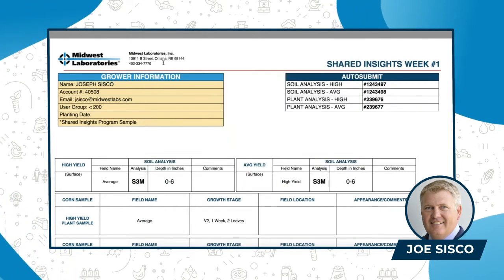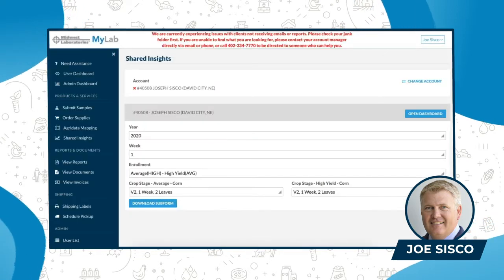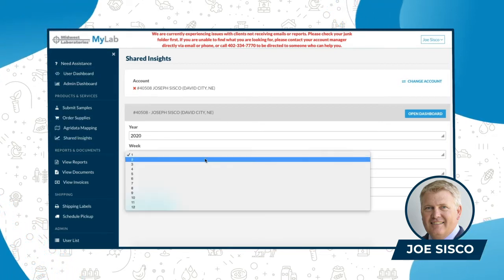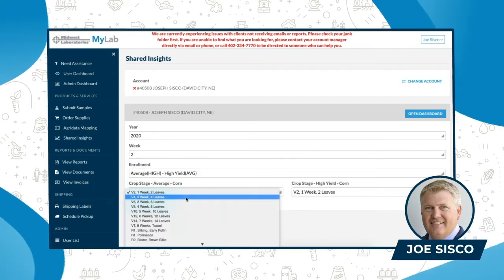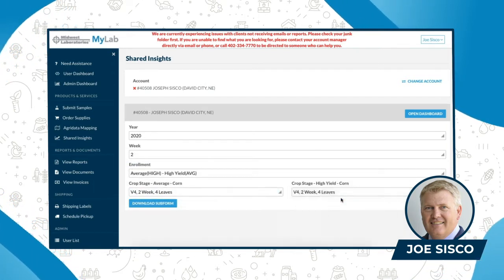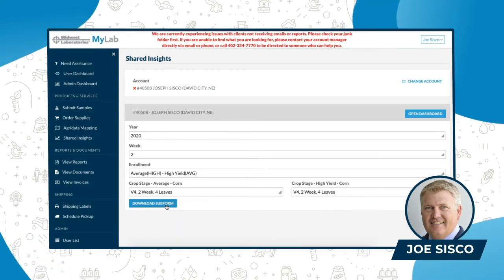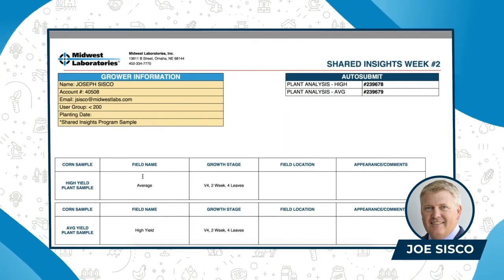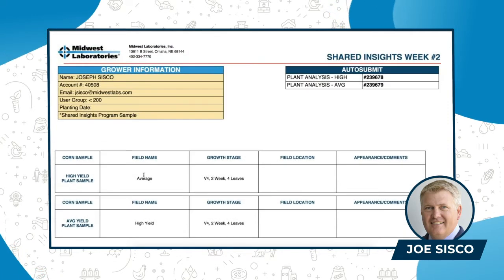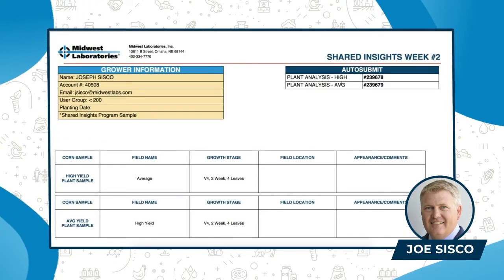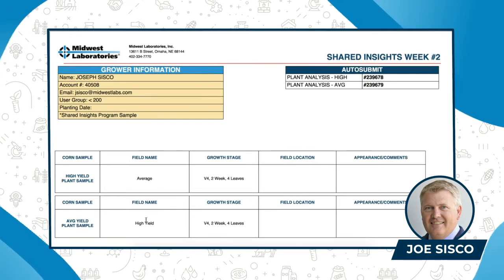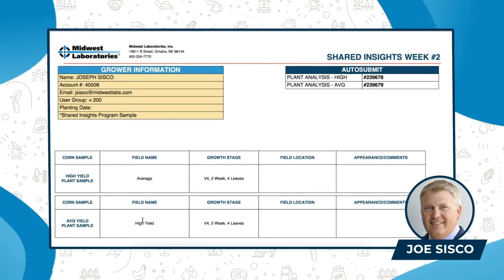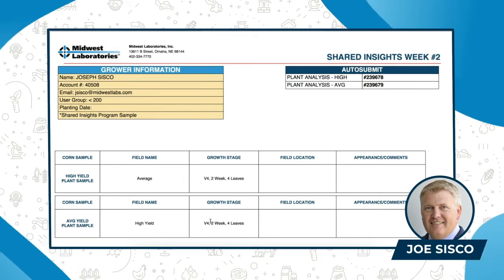I'm going to go back to my MyLab, the Shared Insights program, and change it to progress through to week two. I would be at V4 corn, and then I want to download that sub form. You can look through this and make sure everything's correct. You have two plant analyses — one for the high, one for the average. The field name is 'average,' the other field name is 'high yield' — it could be whatever you want. V4 is the growth stage for both.